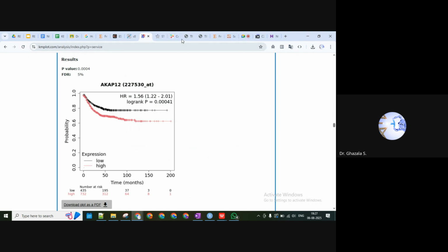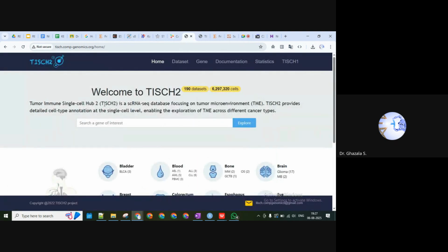So for that we have a tool here. This tool is specifically working on immune related tumor cells. It is specific to cell type, and that will vary, so in which category your cells are lying. So based on, as we just saw, suppression or progression.